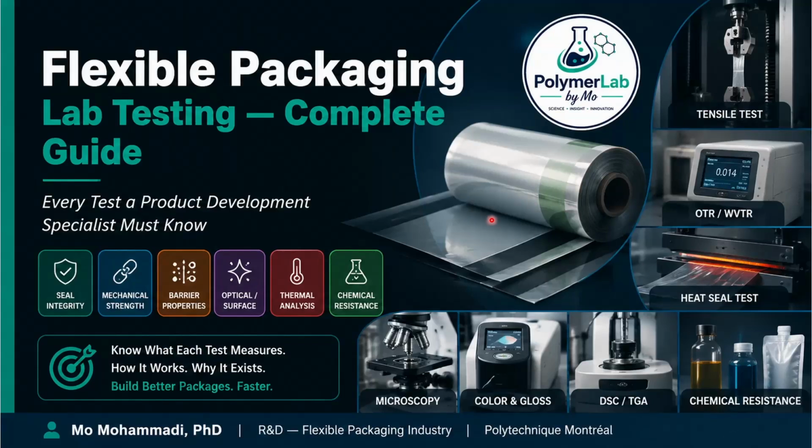If you develop flexible packaging structures, or if you validate them, qualify them, or approve them, and you want to understand every lab test that stands between your design and a package that actually works in the real world, this video is for you. Flexible packaging is not just a film, it's a multi-layer system, each layer doing a specific job, and each one of those jobs can be measured. That is exactly what we do in the lab.